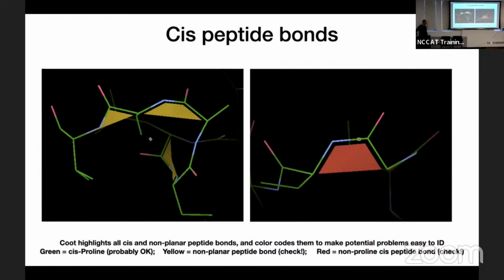The vast majority of structures I've looked at recently from our lab, I can't remember one. There are some cases, like in this antibody light chain. I'm pretty sure what I was remembering was a cis peptide bond that is not a proline. So they can happen. They're often in structurally important proteins. When you have something weird like that, it will often be in the active site of the enzyme or something, because they're there for a reason. But yeah, very, very rare.